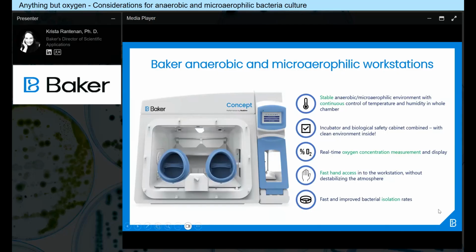And talking about transferring the materials, everything that is taken into the workstation travels through the interlock on the side. So Krista is nicely pointing out the interlock space. This ensures that no excess amount of oxygen, no excess amount of the normal air is introduced into the chamber, thanks to the interlock purge in between the outside world and the inside of the chamber.